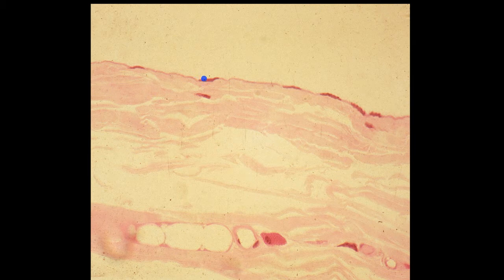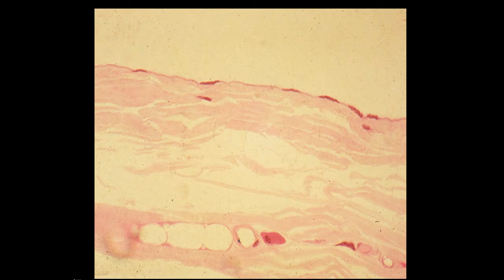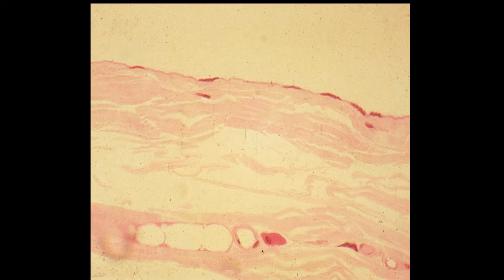mesothelium. You can also note a simple squamous epithelium that lines blood vessels. You can see that here, and you can see a little bit of it here and here. When the simple squamous epithelium lines blood vessels, we give that the name endothelium. Near these little capillaries, you can also observe some connective tissue cells. So there's probably a fibroblast here, and this is probably a mast cell.